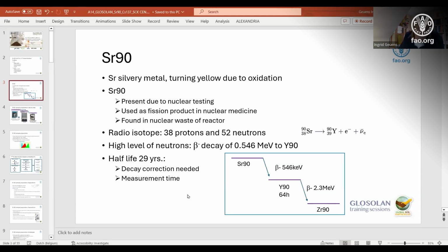And then the other protection is, of course, monitoring. We monitor the lab, but we also monitor ourselves. So when you are entering our labs, you will all be monitored constantly. So the highest protection is to take some distance, protect yourself with plastic tools, and then protect your clothes, hands and shoes.